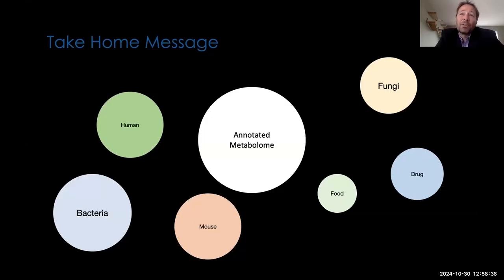But it is difficult. If you were to consume grapes and consume wine, essentially the process of making wine from grapes is a metabolism result. And so it is actually pretty tricky. And I think we will still need to develop new technologies that would allow you to differentiate in a very rigorous fashion whether somebody consumed grapes or whether these were wine products.